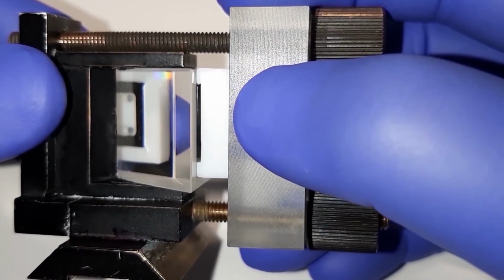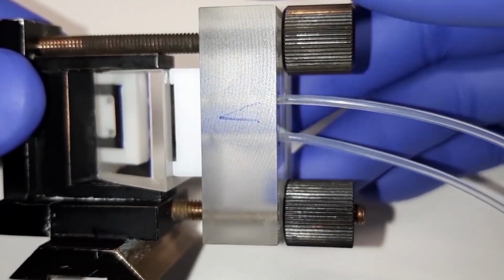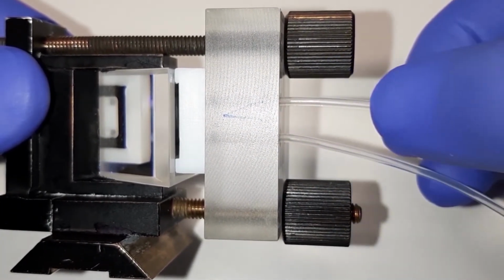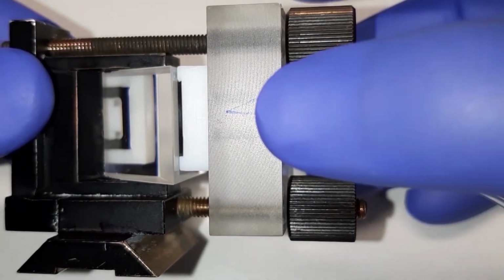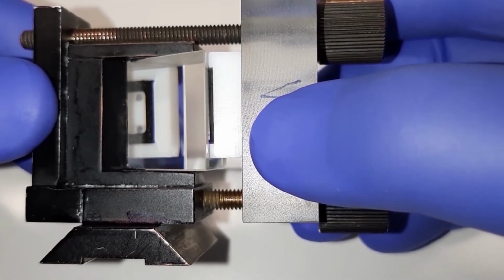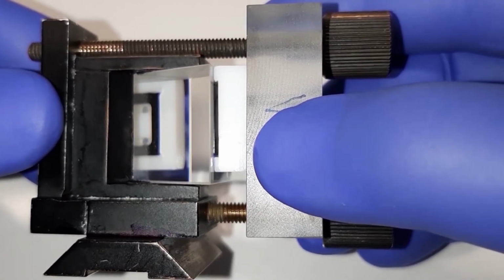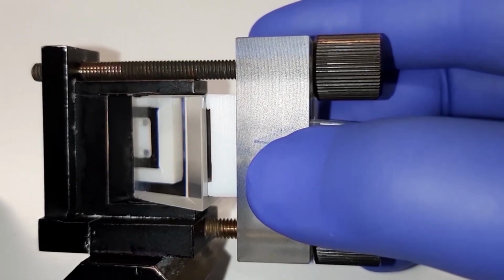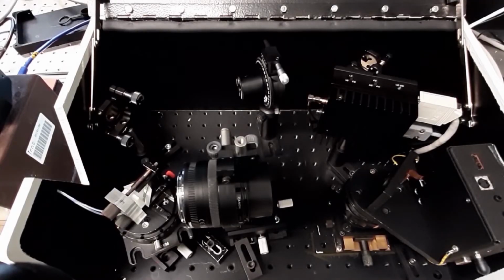You also may see the piping system. This is inlet and outlet tubing. So this is exactly the heart of our PAMONO-sensor. And now let me show the elements of our PAMONO-sensor.